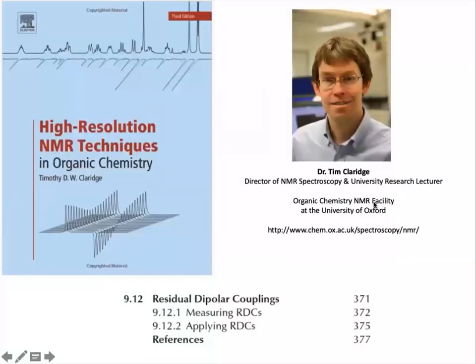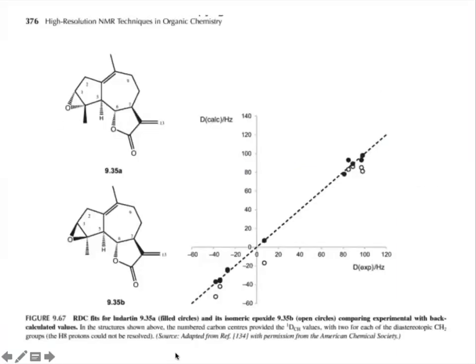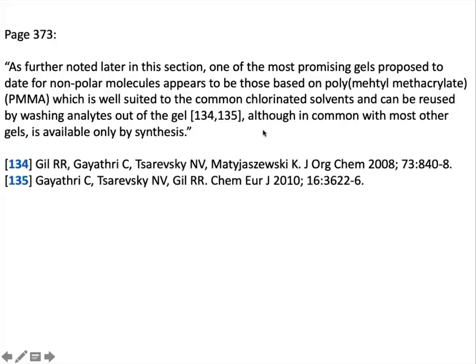So what I just want to say is that for further reading, RDCs were already featured in the 3rd edition of Tim Claridge's book. In page 371, he featured part of my work. Also, he talked about how promising are the PMMA gels. Now we have more than PMMA. I'm very happy that Tim brought this one to a textbook.